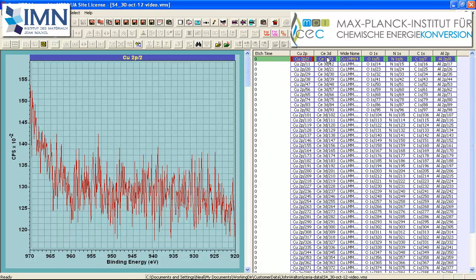This is a cerium 3+ oxide, and rather than acquiring the data into 7 VAMAS blocks, the same acquisition time has been spread over a sequence of measurements that are saved as independent VAMAS blocks. So each one of these spectra represents a poor signal to noise spectrum, but we've got many of them, and by summing them we can end up with a set of spectra with the type of signal to noise that you would expect for quantification by XPS.